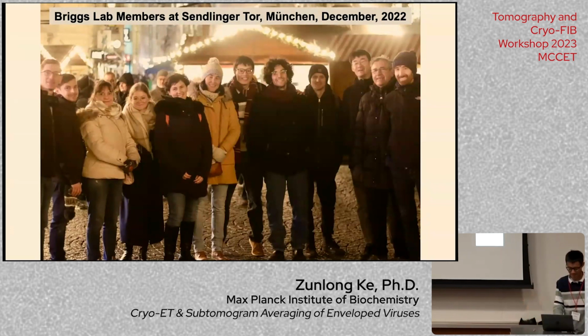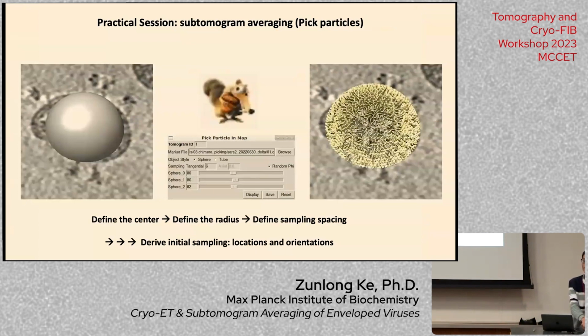Yeah, I had a question, or two questions. One question is how you dealt with maybe oversampling the particles in the early step of the SARS-CoV spike protein on the virion. Because I think in single particle, we have this cool 2D classification to clean out bad particles or junk at the beginning. Curious how you dealt with that.